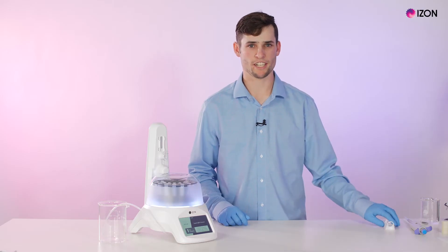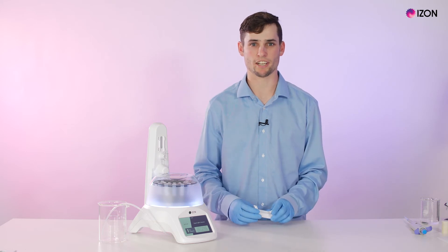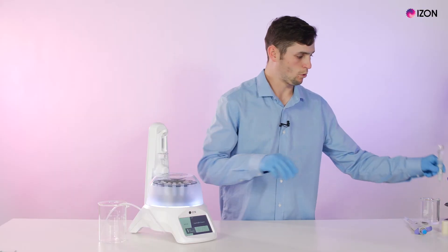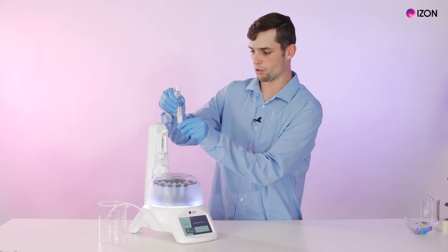To begin a run we first need to select our QEV column and sample of choice. We can then insert our appropriate column mount and column for the process — I'll be using a QEV original.